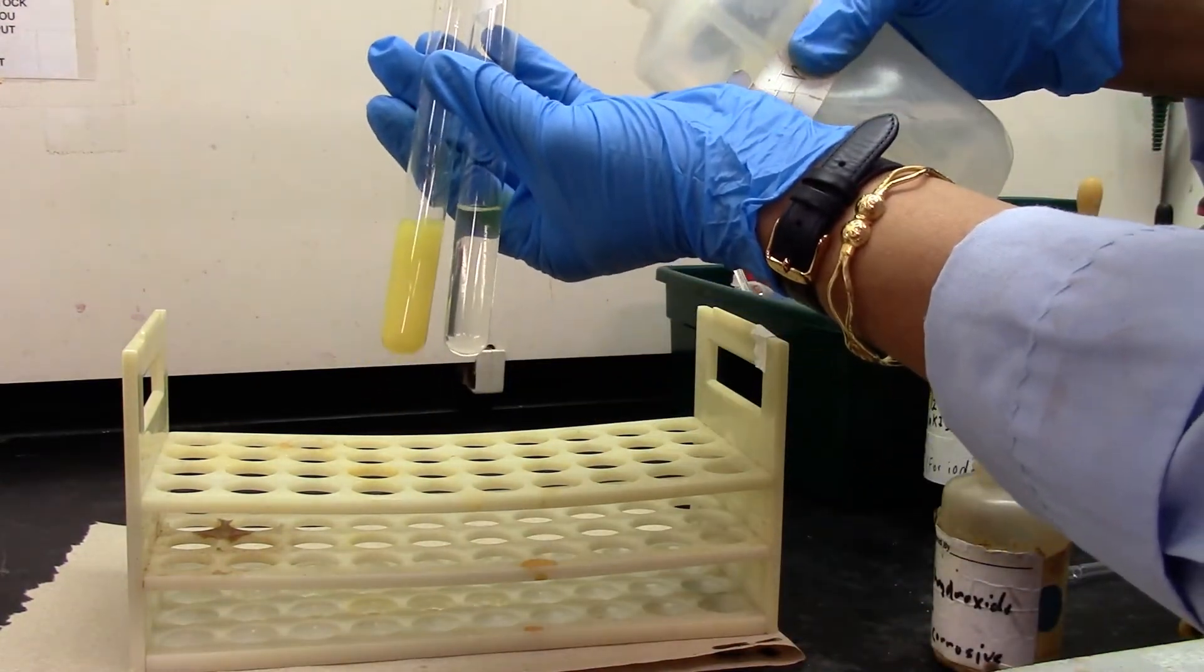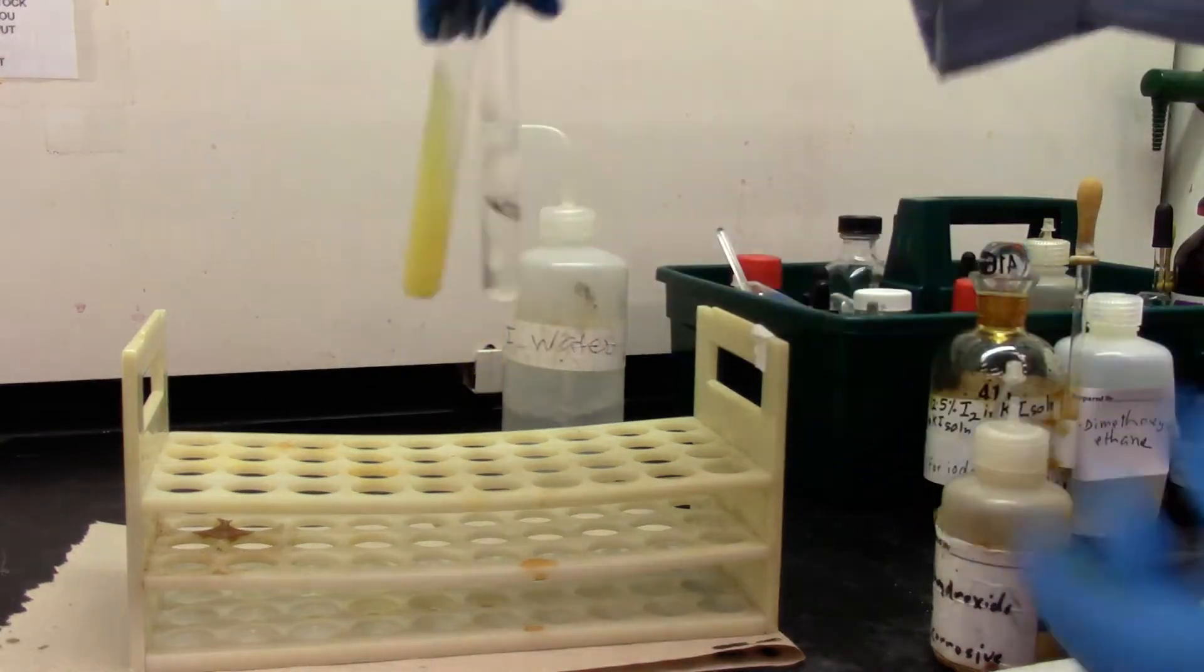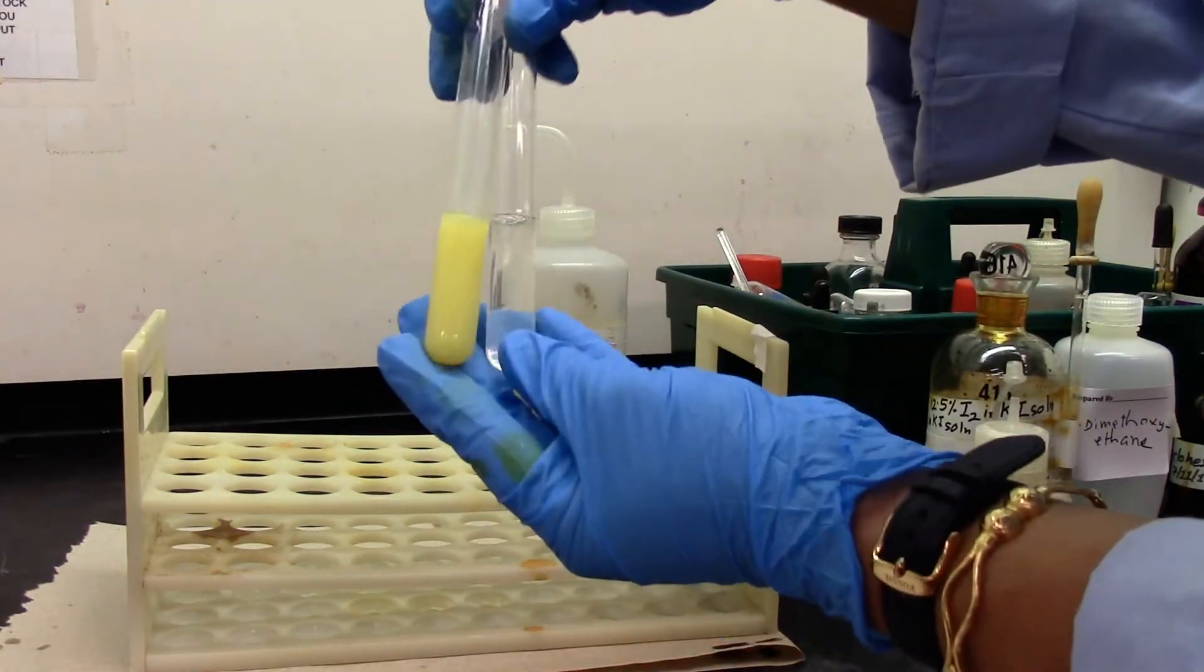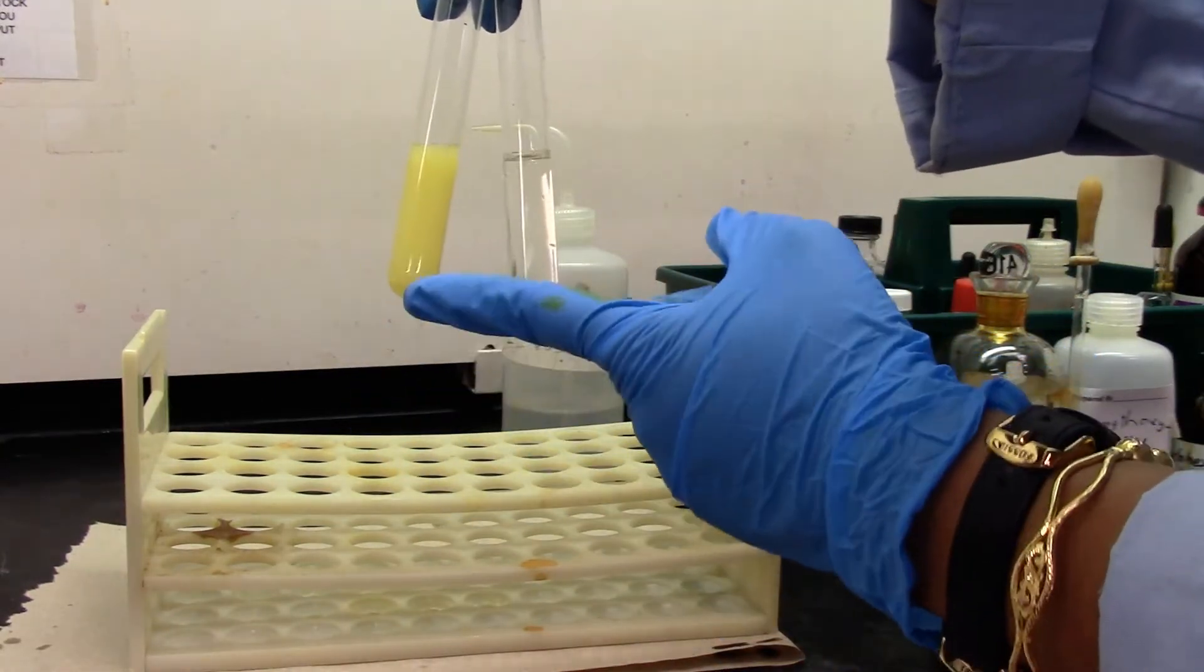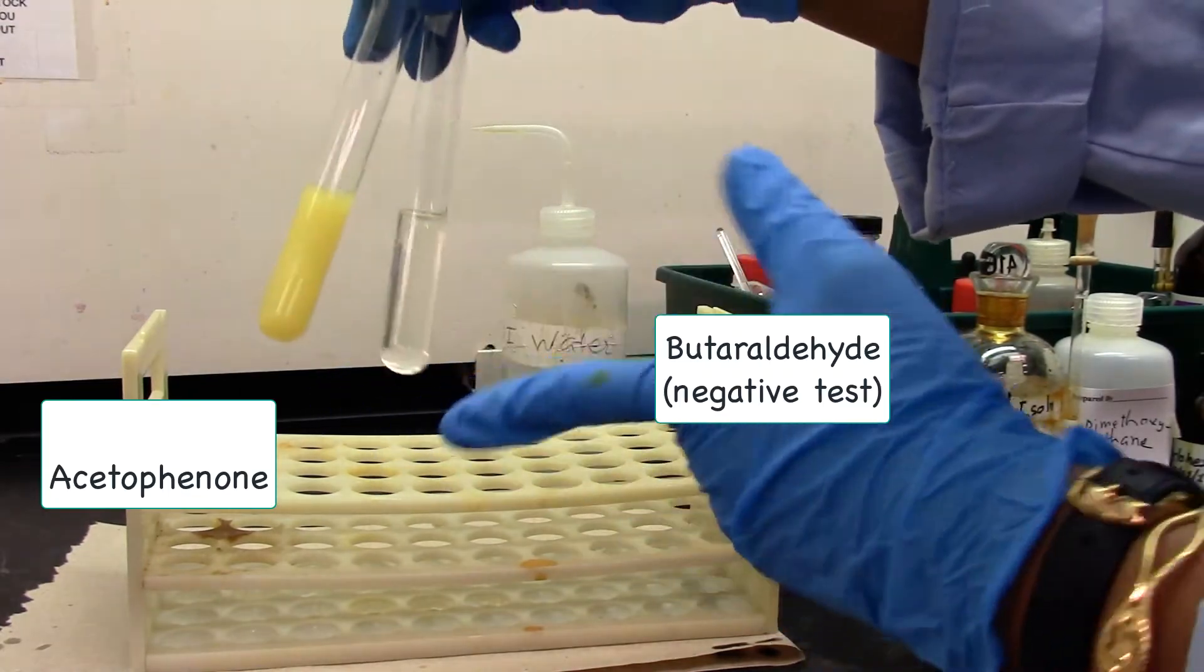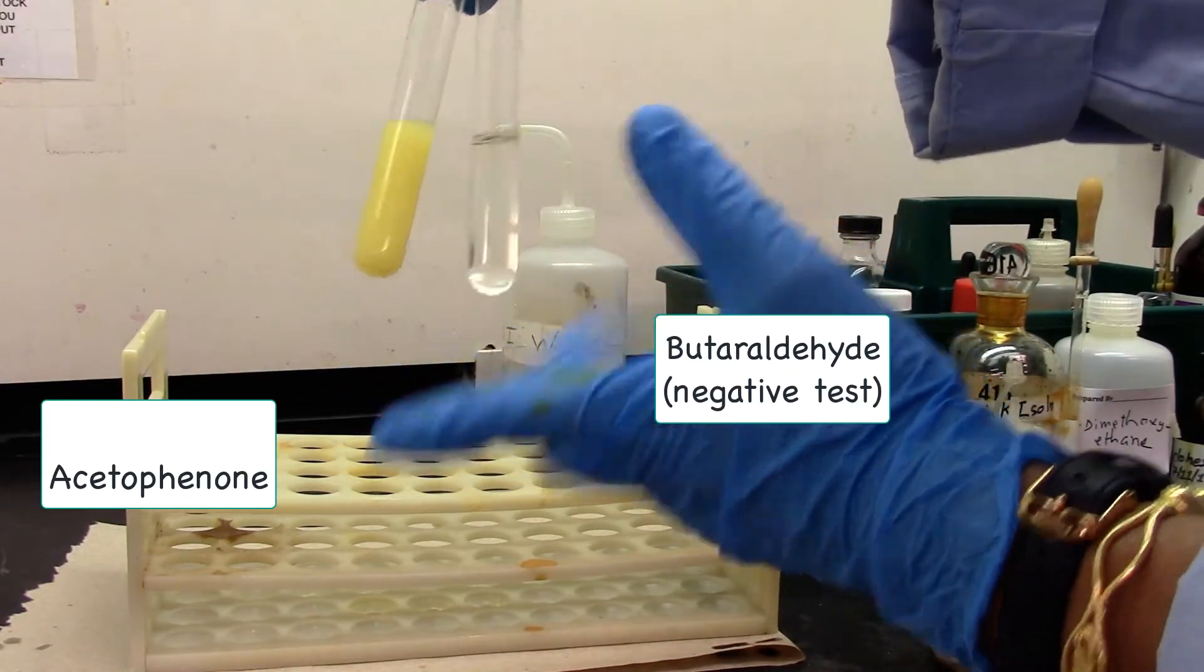That's my negative test. Add a little bit more water. This definitely looks like a cloudy precipitate, yellow cloudy precipitate. This is clear, that's the negative test.